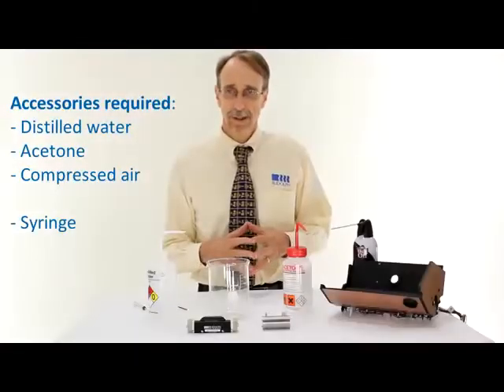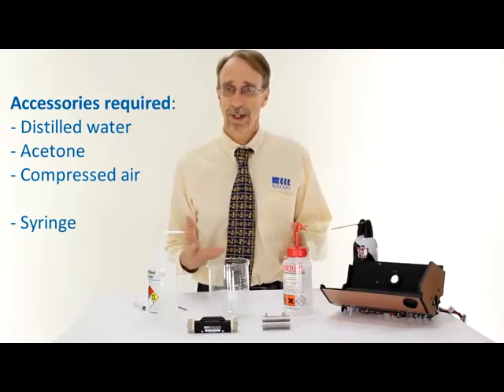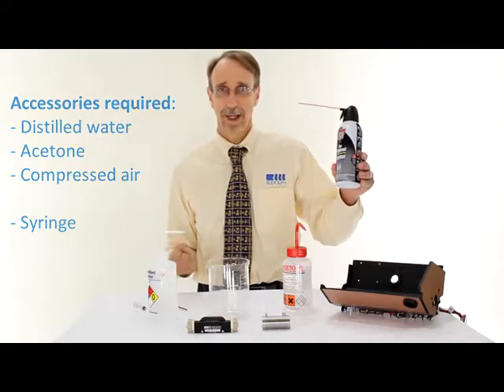After cleaning the cell, we need to dry it. In a laboratory, this often means drying it with oil-free compressed air or compressed nitrogen. However, for this video, I'm going to use canned compressed air.